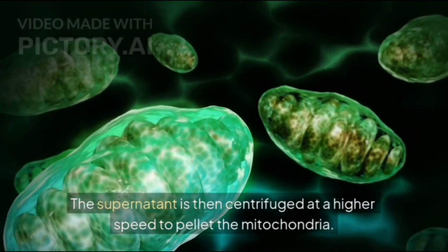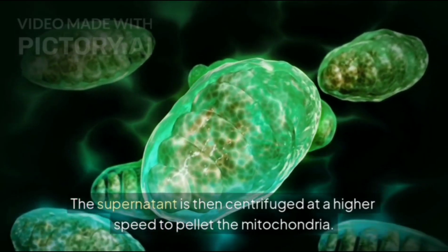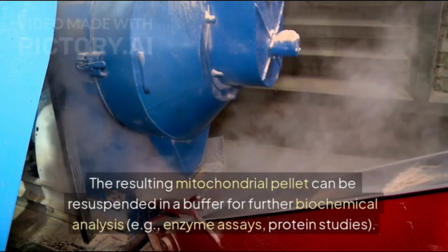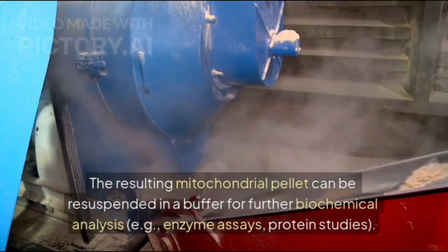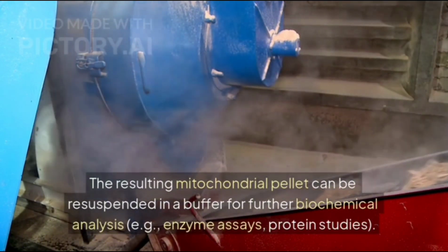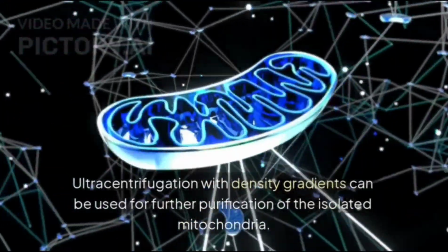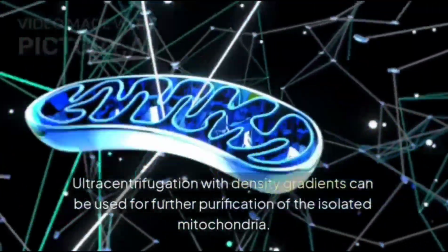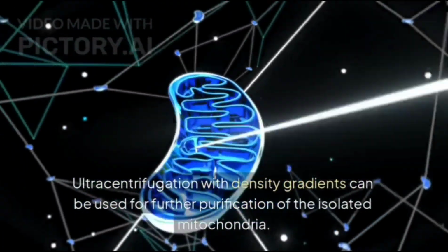The supernatant is then centrifuged at a higher speed to pellet the mitochondria. The resulting mitochondrial pellet can be resuspended in a buffer for further biochemical analysis, for example, enzyme assays, protein studies. Ultracentrifugation with density gradients can be used for further purification of the isolated mitochondria.